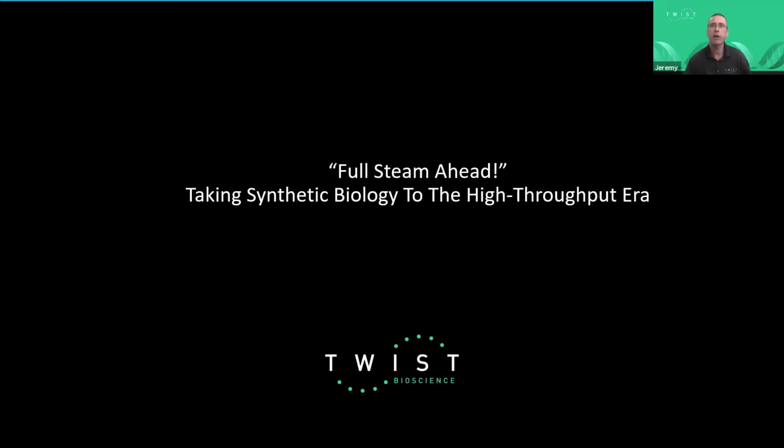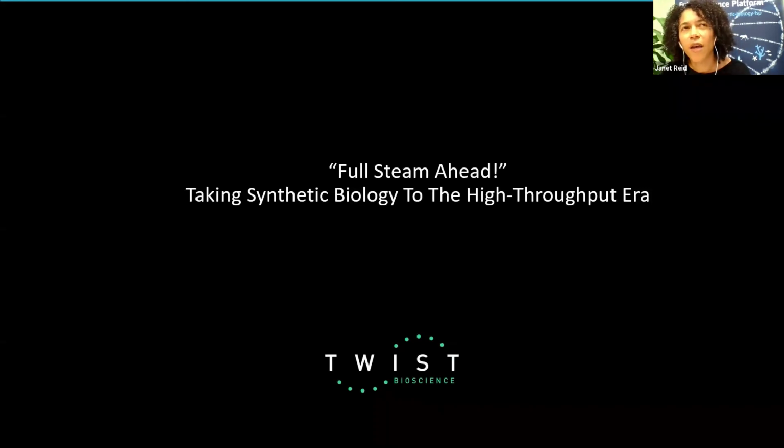A technical question: which 96-well DNA isolation kits do you find work best, especially for E. coli? So far, we've been using the Invitrogen kits, which was their column-based kit. Can't remember the name of it quite offhand, but we're going to use their MagBead kit next as well. And we've got another MagBead kit coming from Zymo Research as well, which we've had some good results from some of the other Zymo products. So we're hoping that will be good.